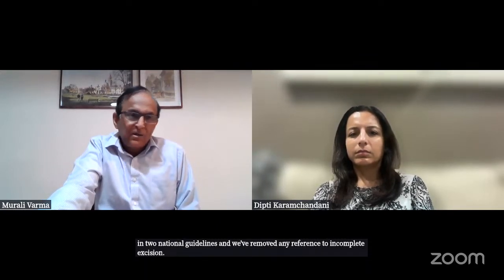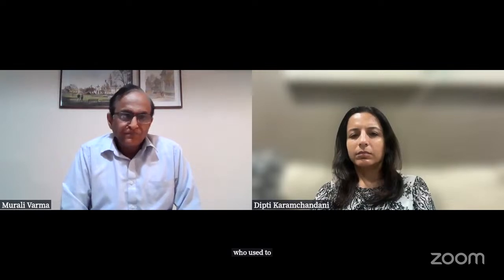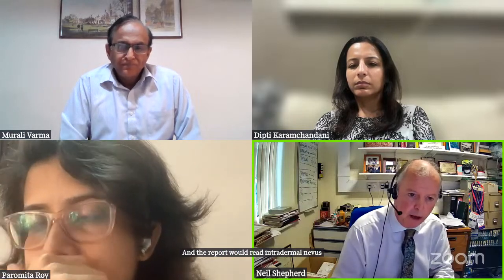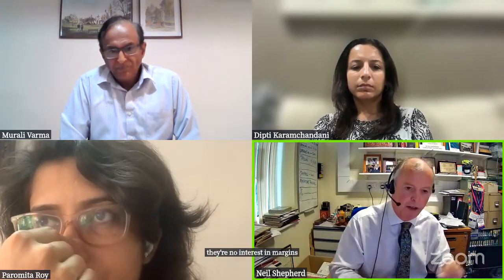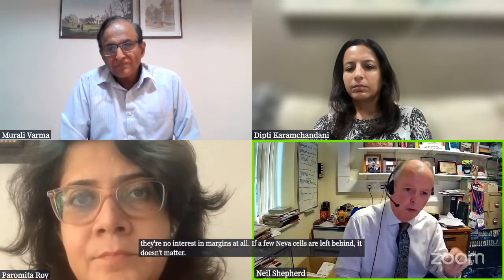So years ago, we had a locum here, a dermatopathologist, who used to report on shaves of intradermal nevi, and the report would read intradermal nevus incompletely excised. Now, dermatologists shave nevi and they have no interest in margins at all. If a few nevus cells are left behind, it doesn't matter. We should not use those words.